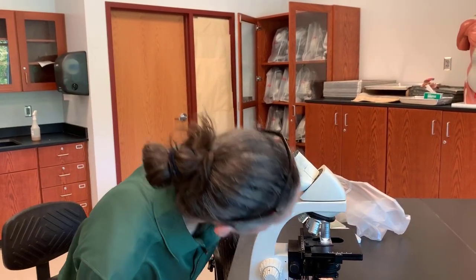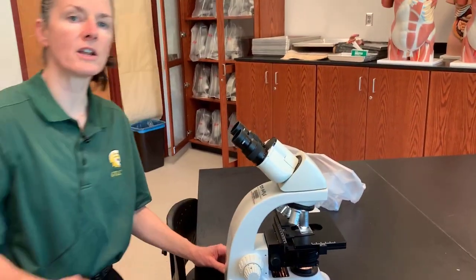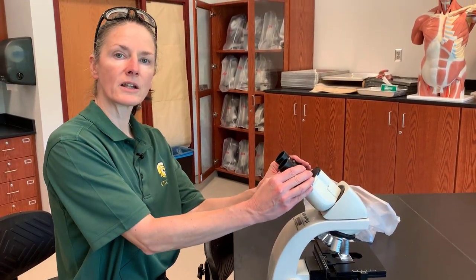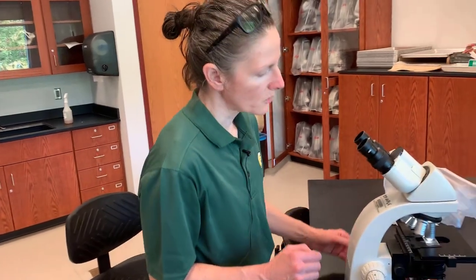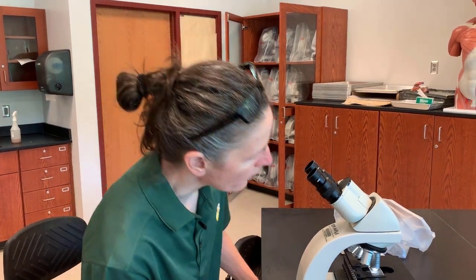Our high power lens in this case has a 40x magnification. That means we have a 40x magnification here and 10x magnification in the ocular lens, so we will get a 400x overall magnification. The formula for your magnification is going to be your objective lens power times your ocular lens power — that will give you your overall magnification.